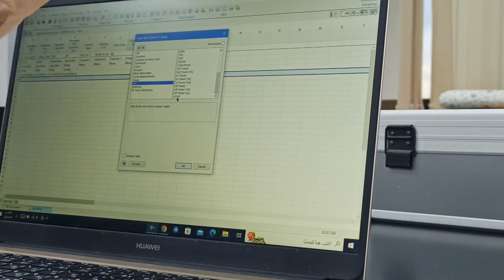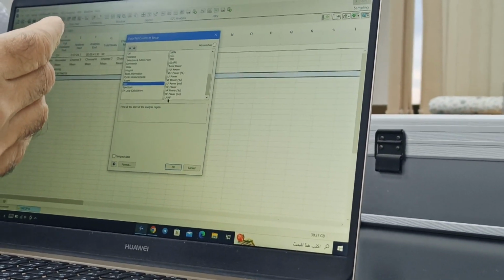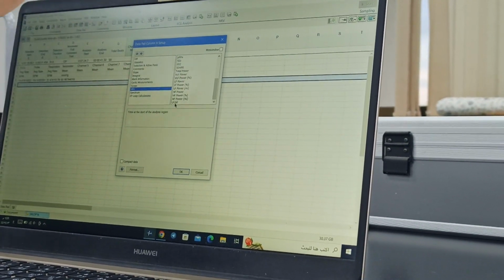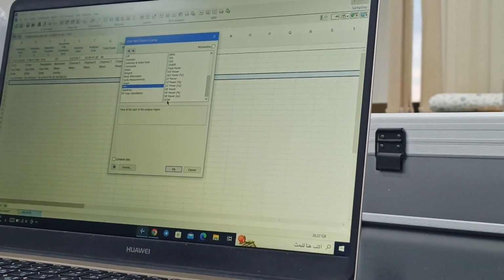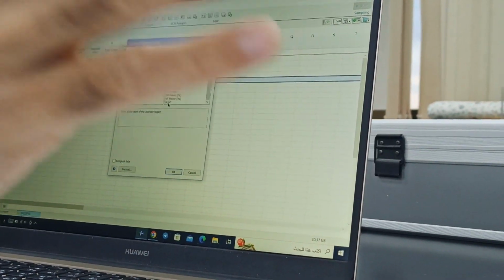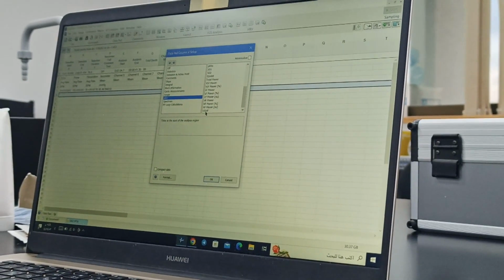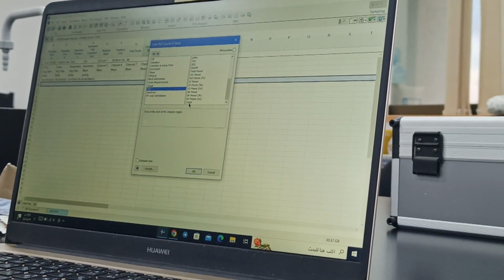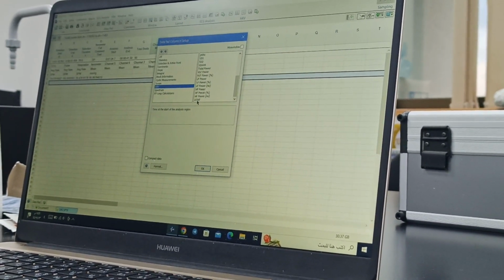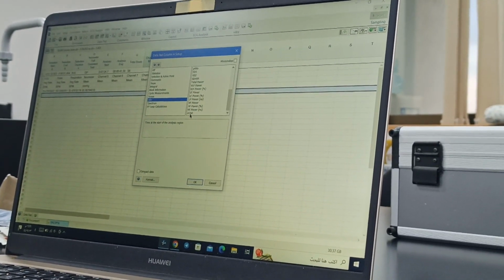Whatever you record, you will open this file and append the newly recorded file to this file and name it. Then you just select add data, select add data, select add data. So all the things will be there. It makes your life very easy. Your job will be to select the correct area for data analysis and do some settings if required. What are the areas that are required?